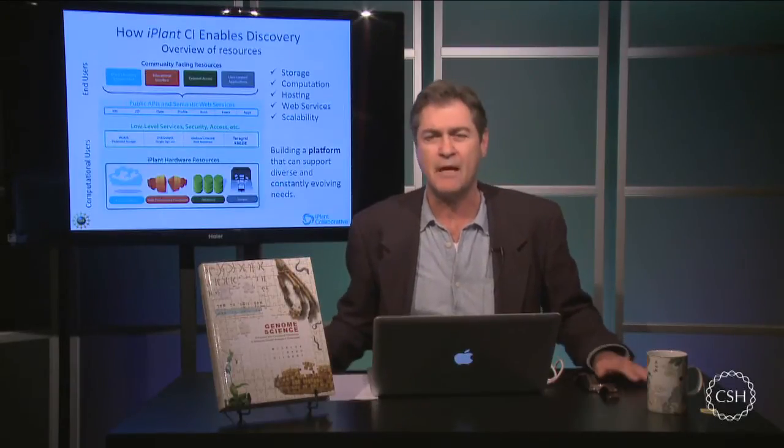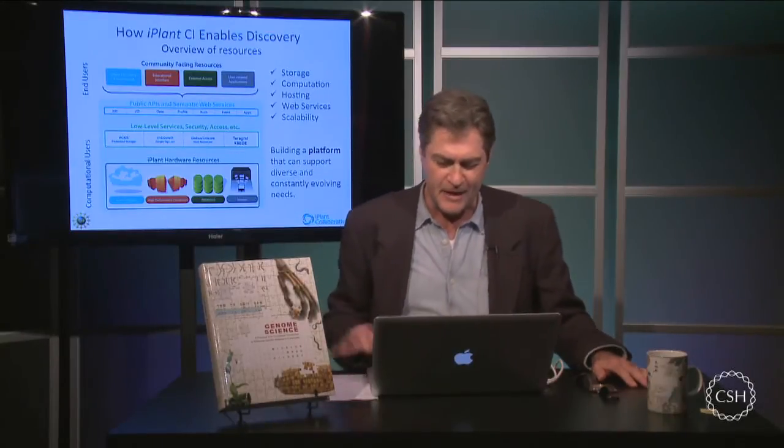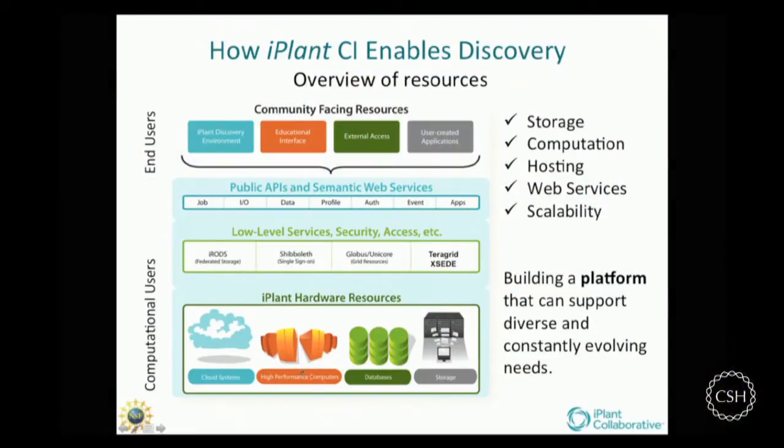If you're not sure what a cyber infrastructure is, frankly, I'm not either after 5 years, but it involves a lot of hardware, which is called the lowest level of the infrastructure, a lot of systems that allow this hardware to communicate with one another, ways into those data, and finally, into those tools and services, and finally an interface such as we're going to use today that allows a mere mortal such as you or I to access all this high power computing.